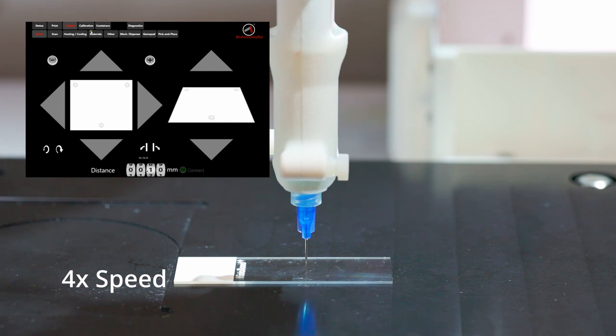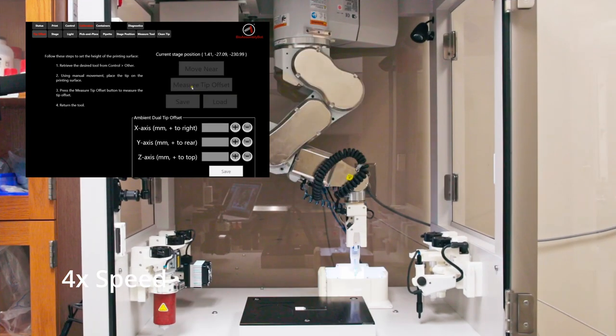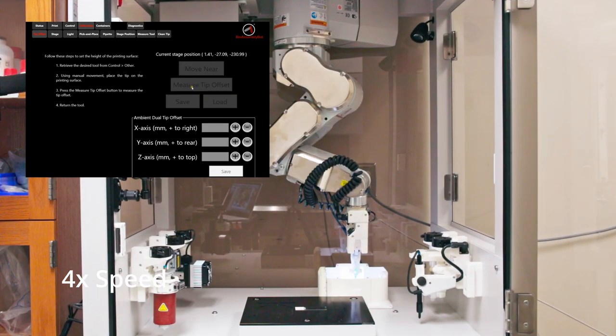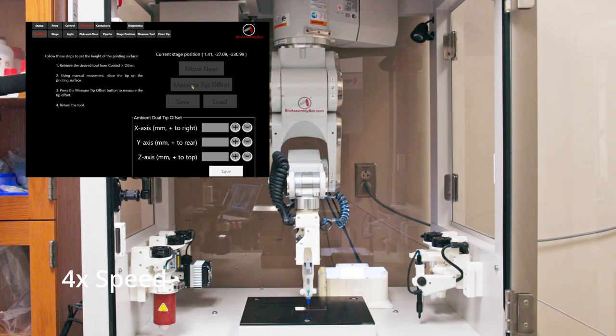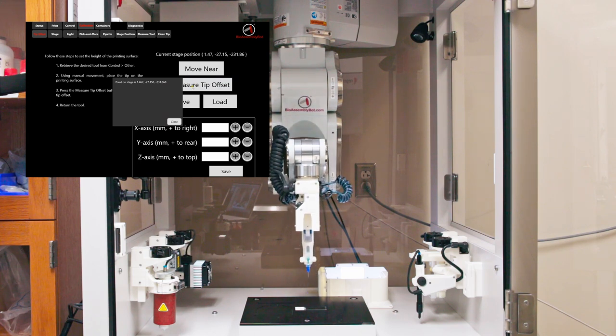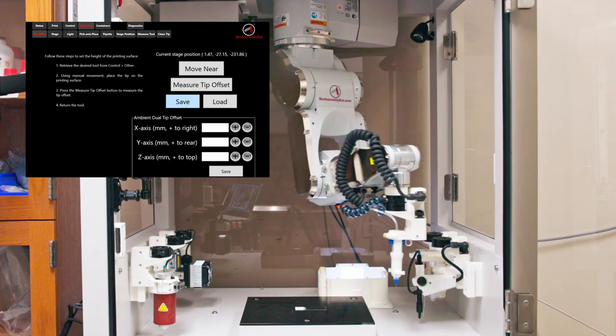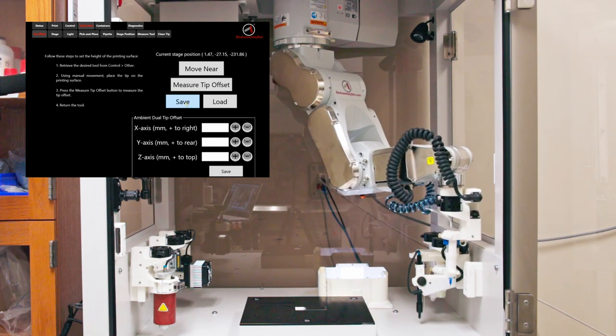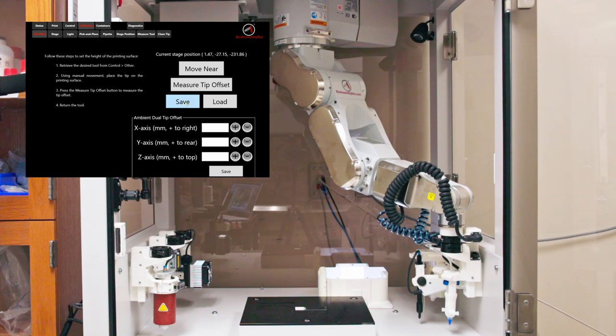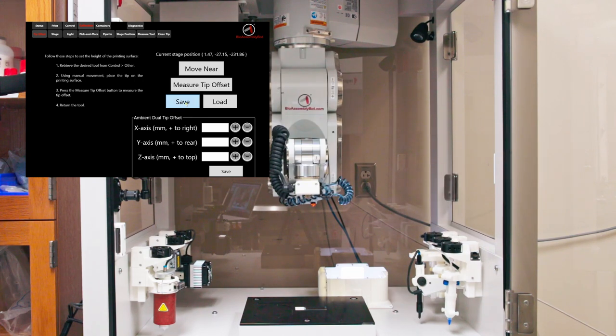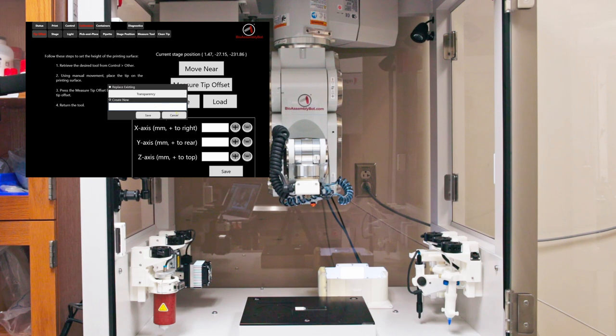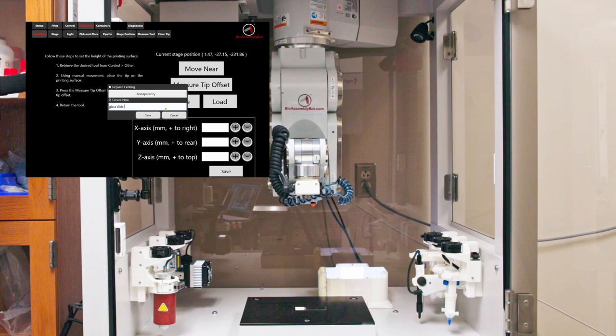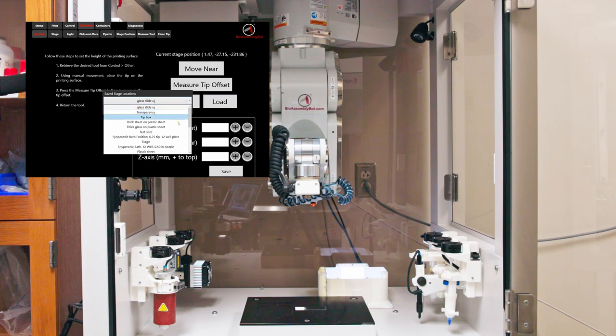Now go to calibration menu, click on measure tip offset. Now click close. We can save this tip offset measurement to use it later while printing again with similar print surface and similar needle and syringe types. Click on load to open previously saved measurements by selecting from the dropdown list.